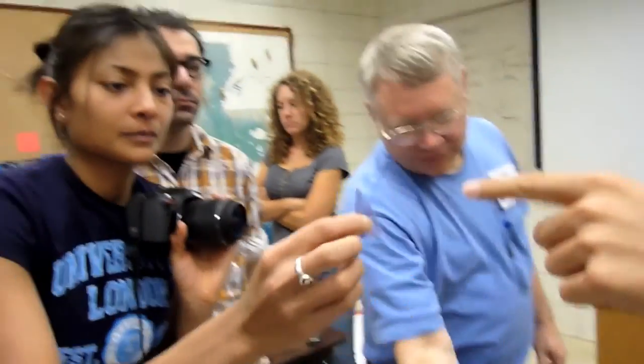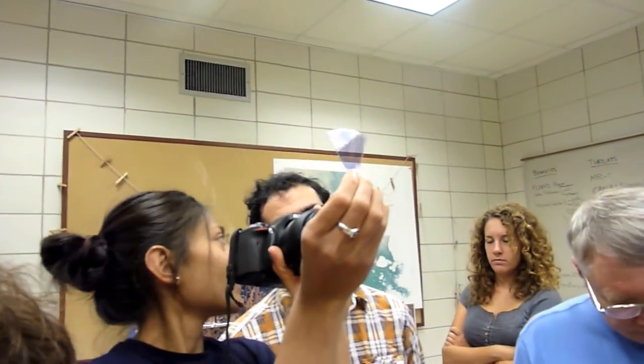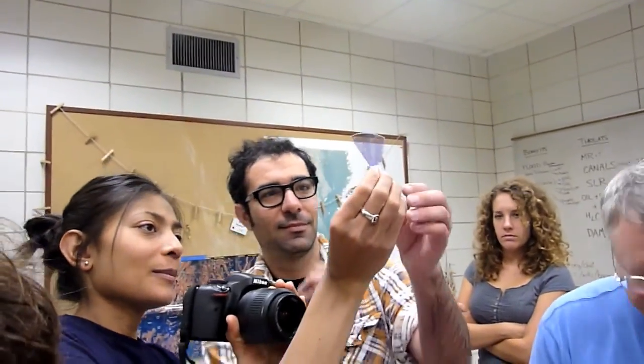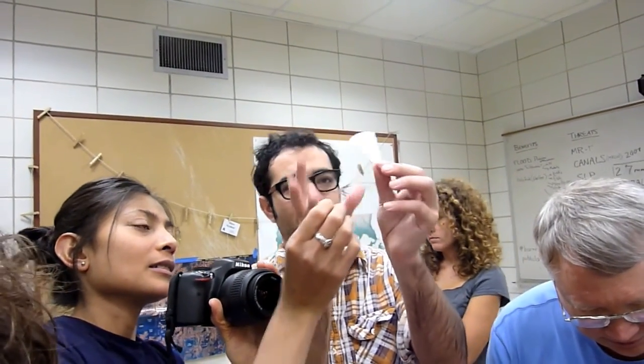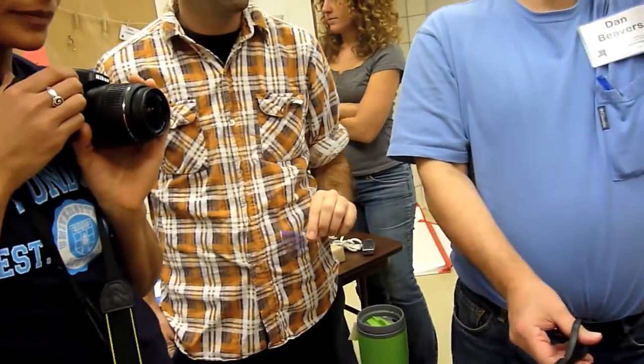I haven't done a quantitative look at this, but these weird patterns from the cutting, I don't think they make a big difference. I generally try to avoid any irregularities, but sometimes through necessity. If you score it with an Exacto knife, maybe. Oh no, the toothpick. Okay. Do you want to cut out a piece that fits roughly in the window? Let's try to do that.